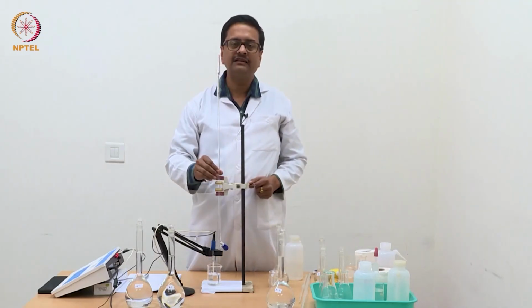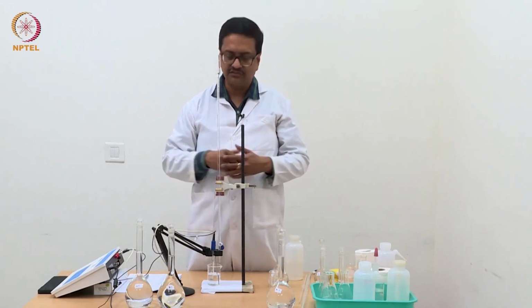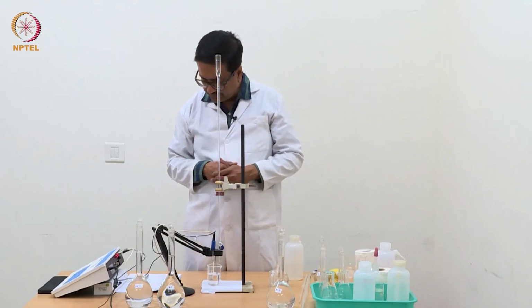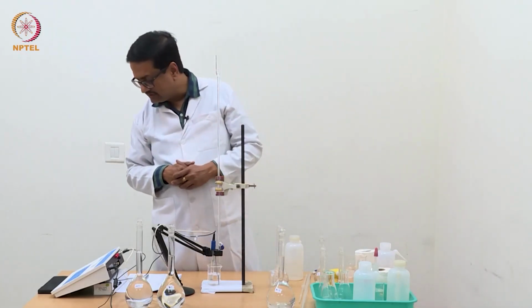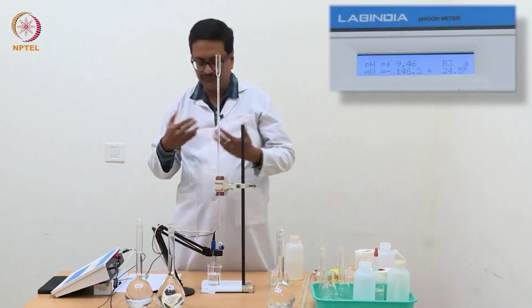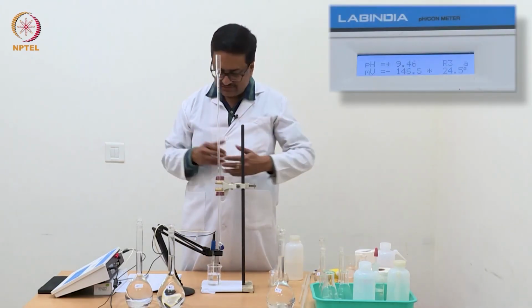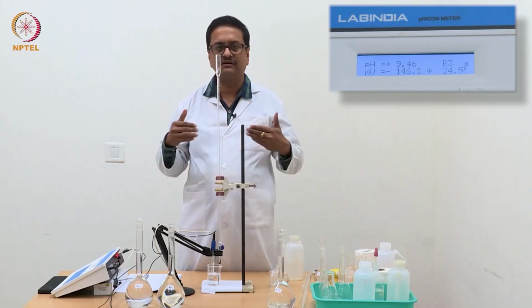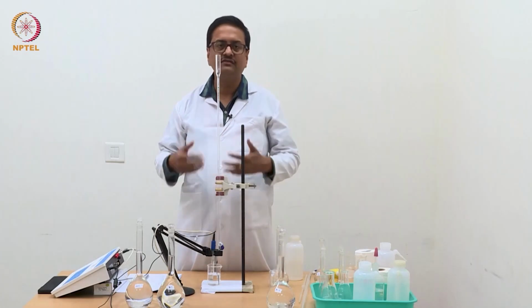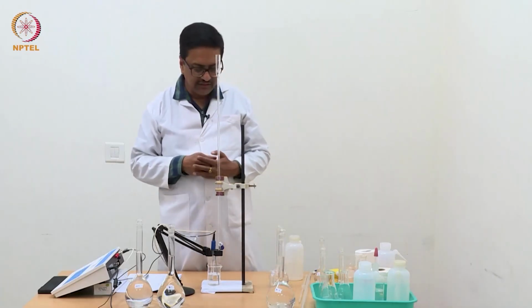By stepwise addition of 0.02 ml each time, now I have reached a point 1.50 ml. You can see that the pH has increased to 9.46, which indicates that the end point has been crossed and we are measuring the pH of a solution which is now a solution of NaOH.